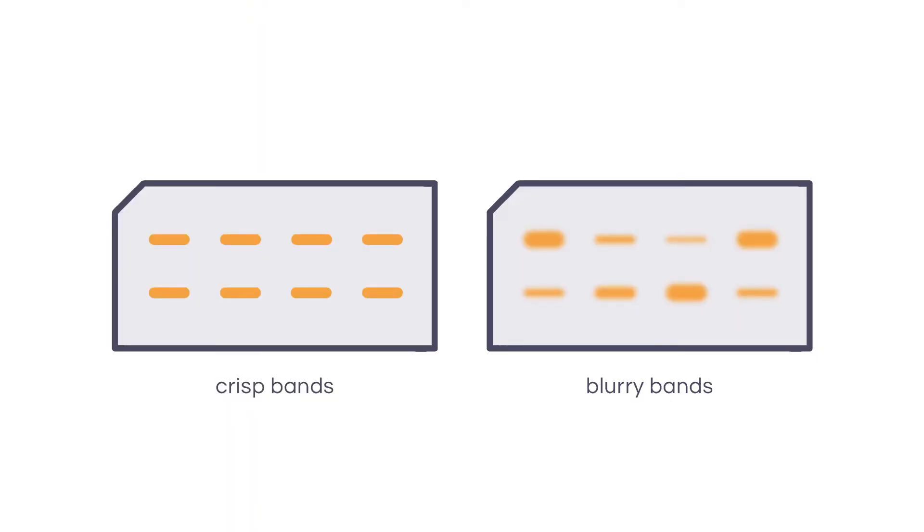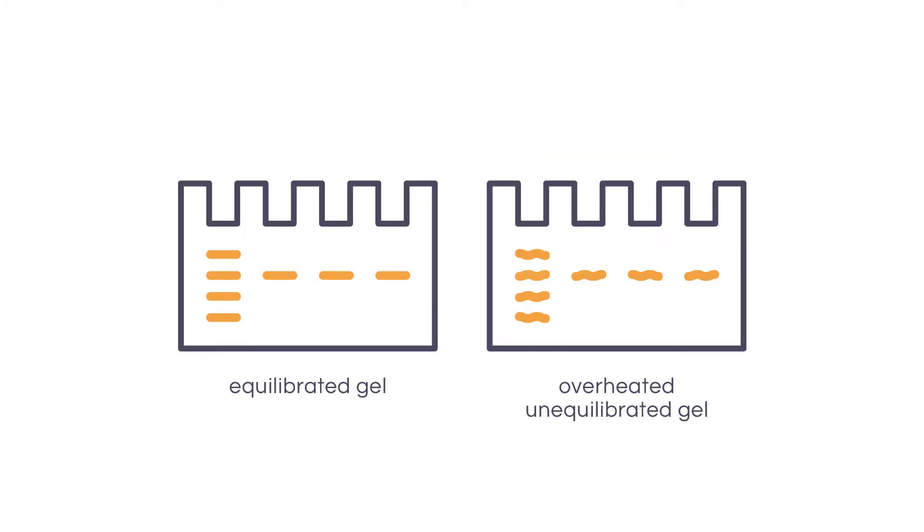Failing to equilibrate the gel in transfer buffer can negatively impact the transfer of proteins from gel to membrane. Without this step, the gel can shrink during the transfer, which ultimately leads to blurry bands. Moreover, excess salts carried over from the gel can cause artifacts during transfer due to overheating of the transfer buffer.